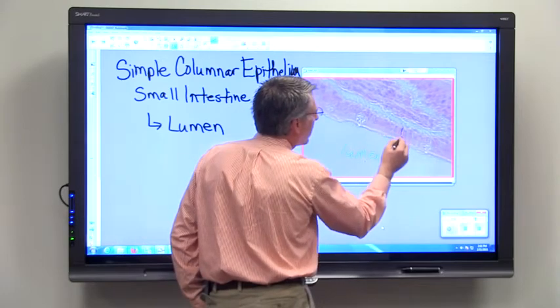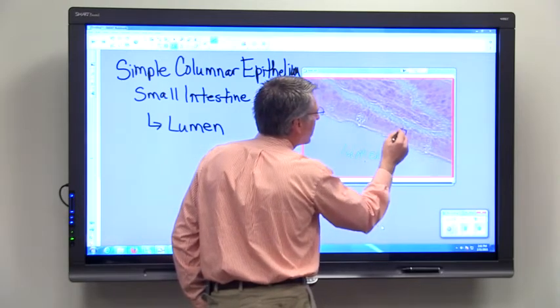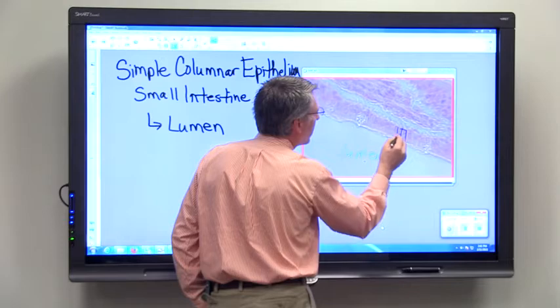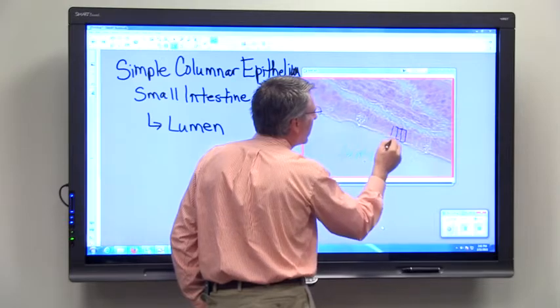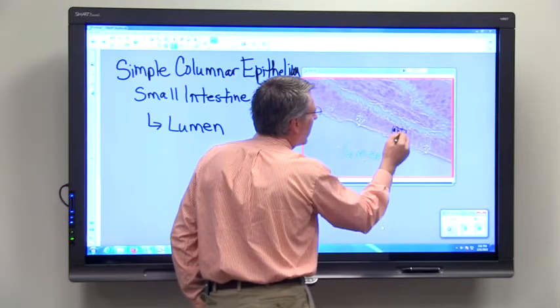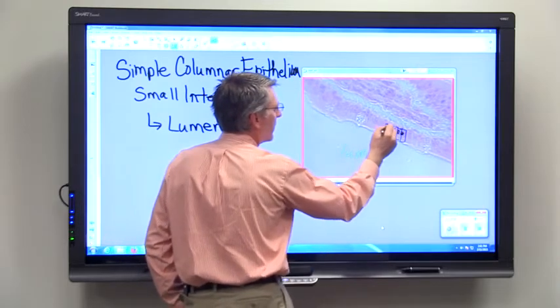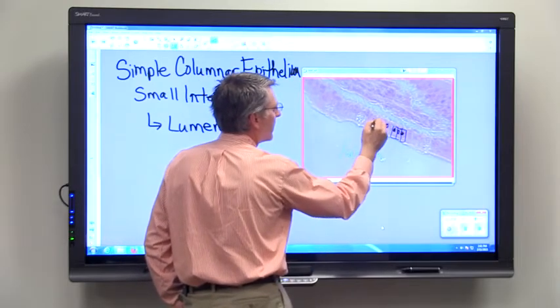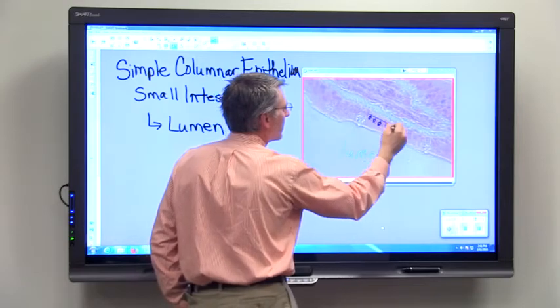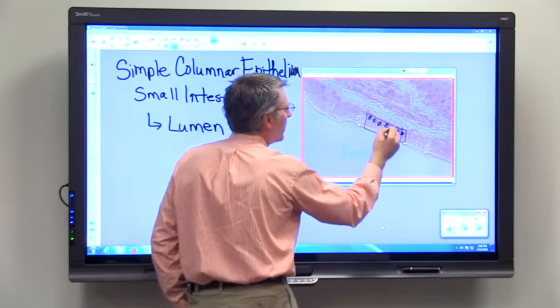I want you to notice here in particular that when we look at these cells, the nuclei are all found in the same layer. Here's another nucleus, here's a nucleus, here's a nucleus, here's a nucleus.